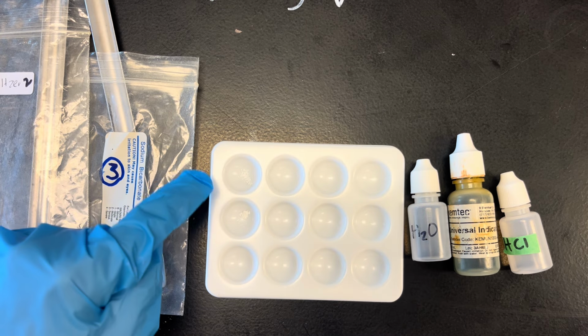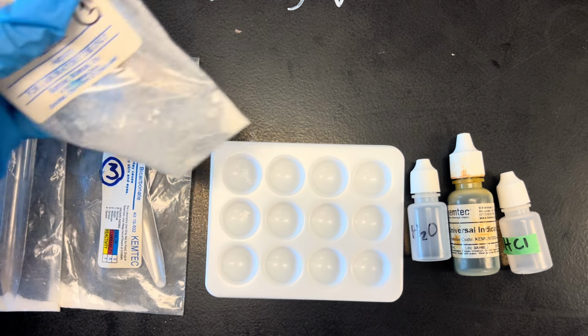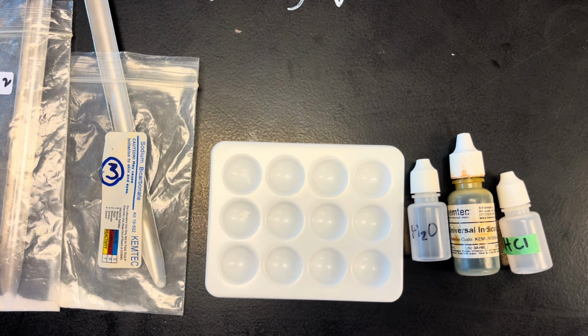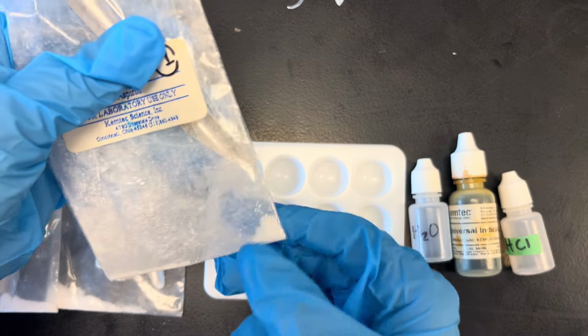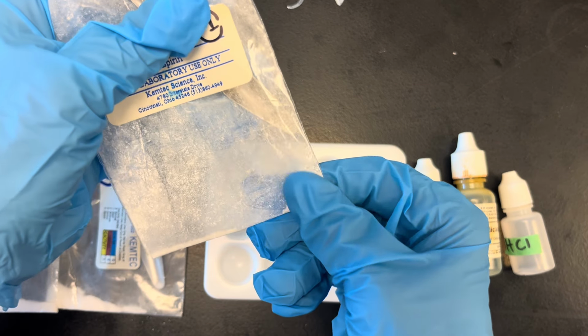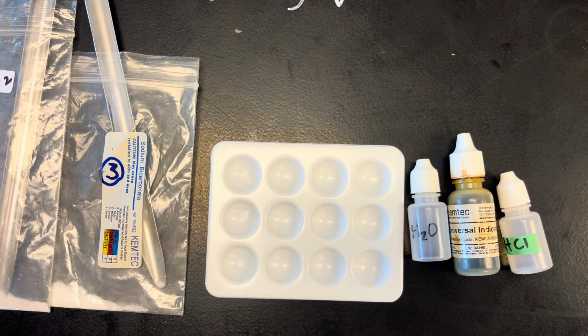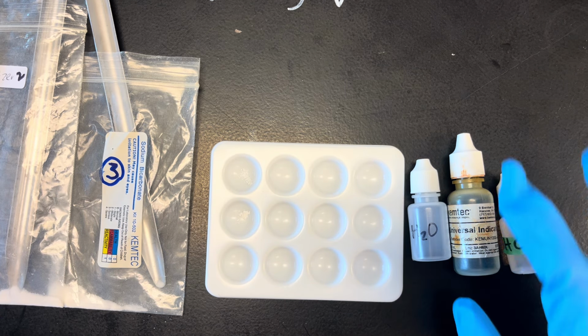You're going to record the color and the texture of the powder, which you can do by looking in the tray, but also by looking in the bag. You'll notice that they do look pretty similar, so try to be specific about the powders. Like, you might feel them through the bag as well. I would not stick your finger in the well, but you can feel them through the bag to see if they're soft or more like sand, for example, or chunky. Some of them will need to be crushed, so that's another example.